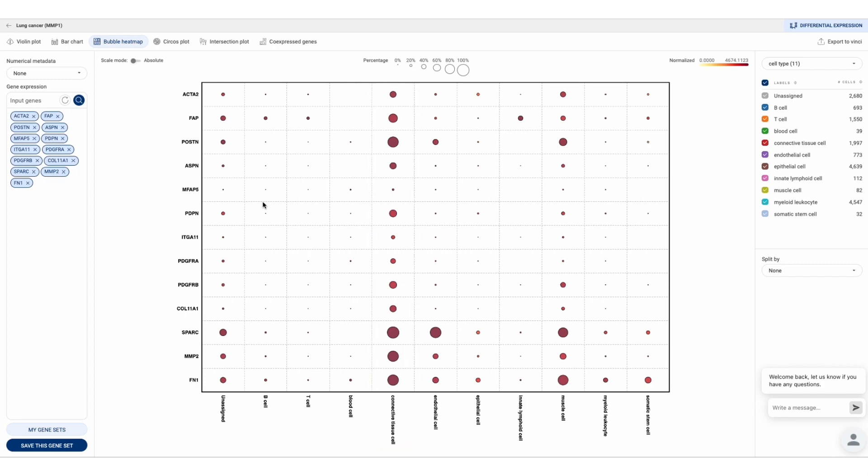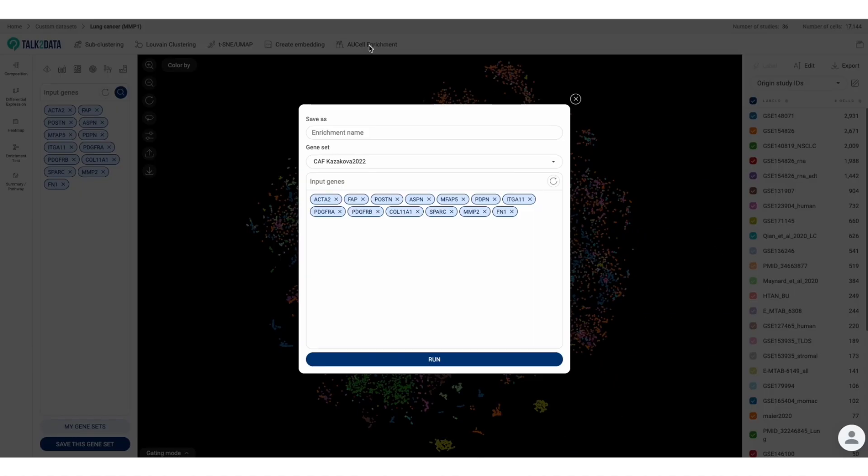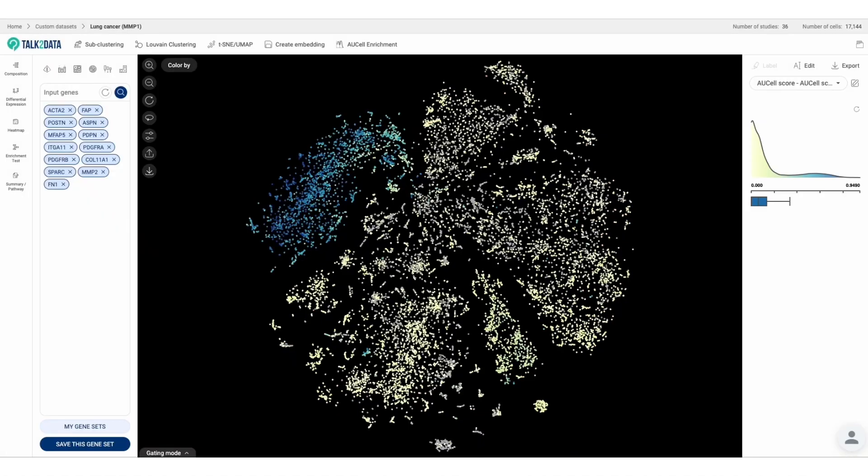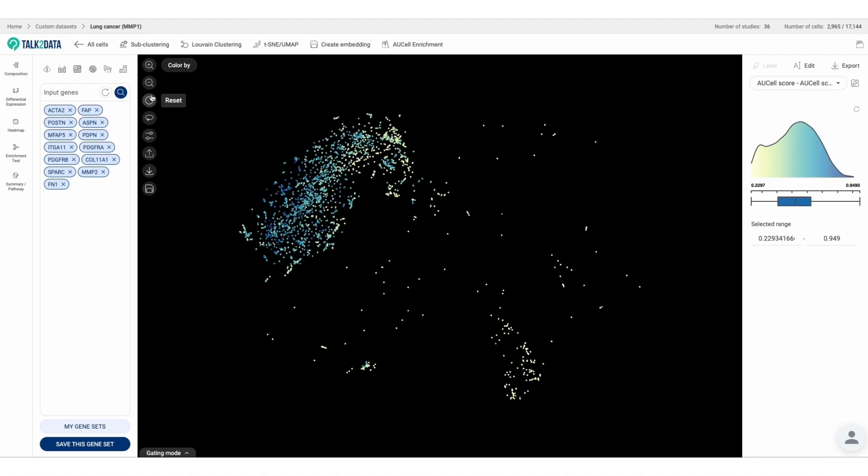To further investigate this cluster of high enriched cells using AUCell enrichment tool, we confirm the CAF marker gene set is highly enriched in the group of fibroblast cells.